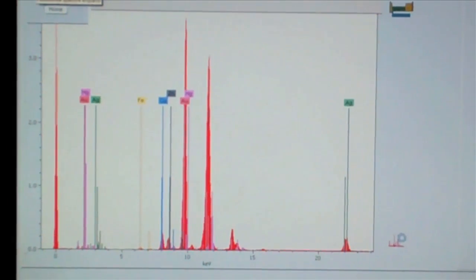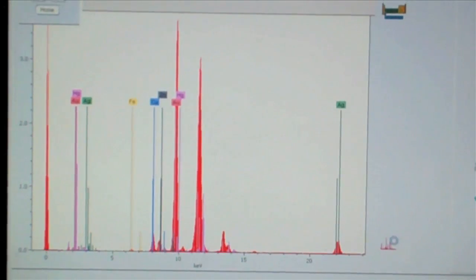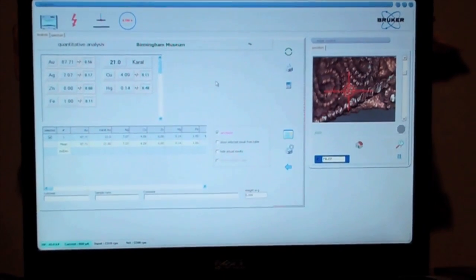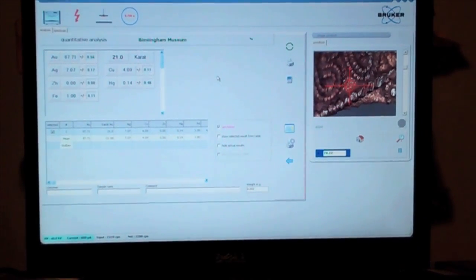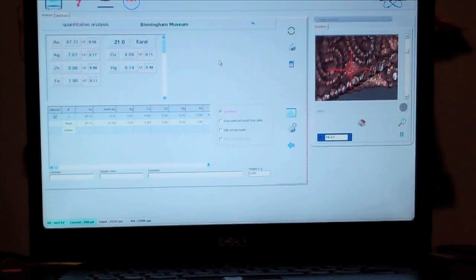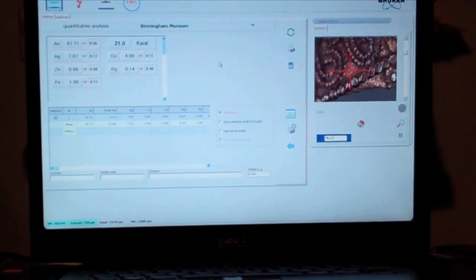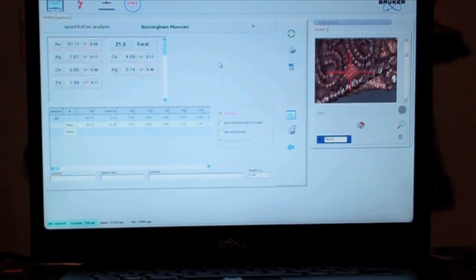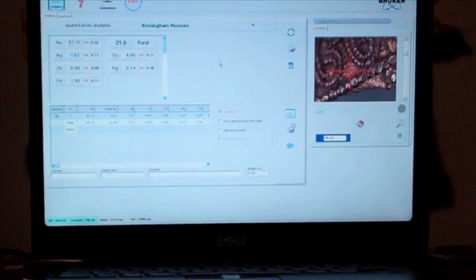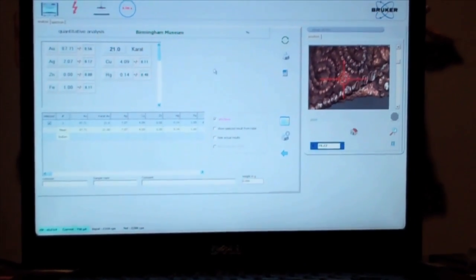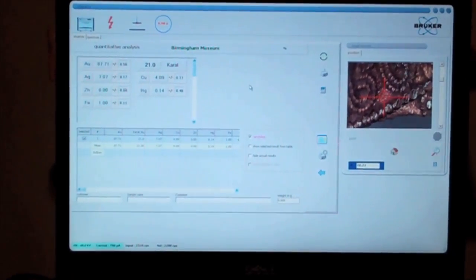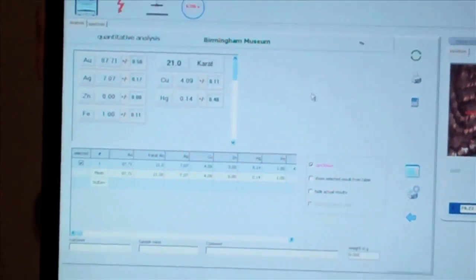So this is the spectrum that's produced by the X-ray fluorescence. What we can see from this spectrum is that the machine has figured out the composition of this gold sheet that we have tested. It is a 21 carat gold. It is made of almost 88% gold, there's about 7% silver and about 4% copper.